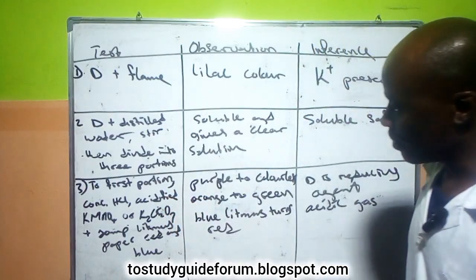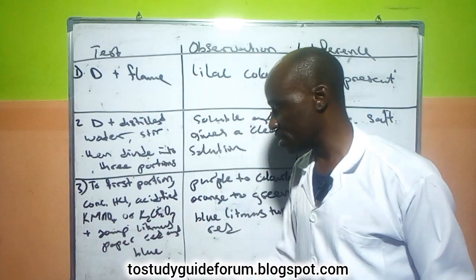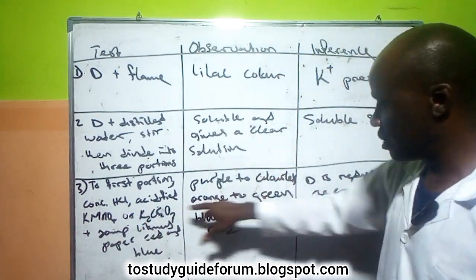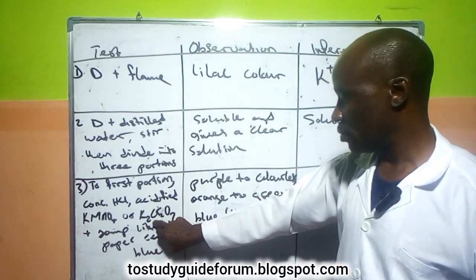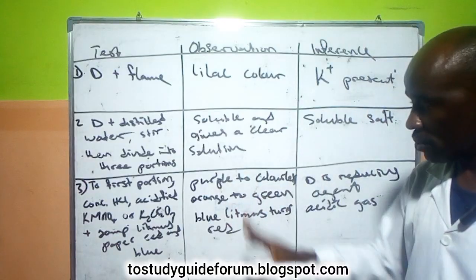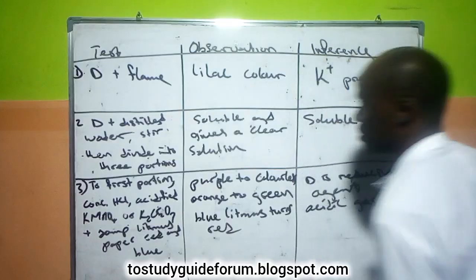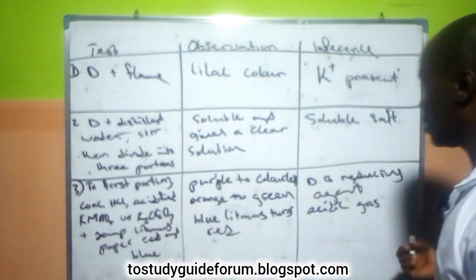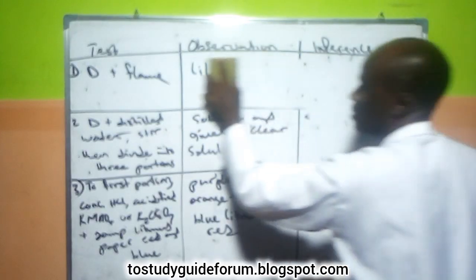So we have done with our first portion. We should have done it in 3 portions. The next one, okay, I know why, because I put this thing together. If I had done this one separately, we'd have this one. If I do this one separately, we also have this. That means we'd use the 3 portions. So what I'm doing here is trying to save a little time. Combining this here makes it easier, so that we can save time in this analysis. It's best like that.